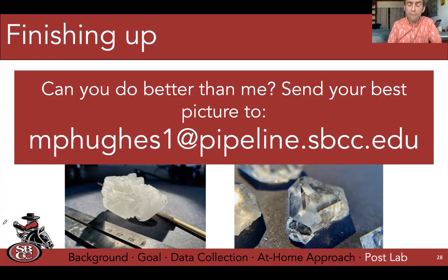So, and I failed too. I mean, I had so many times when I didn't cool it down slowly enough, fast enough. And so I had mistakes. So don't be discouraged. Don't think that every time you have to get something perfect, but you definitely can get some really beautiful crystals that really represent the shape of the unit cell lattice that's extrapolated to the macro scale. Any other questions?